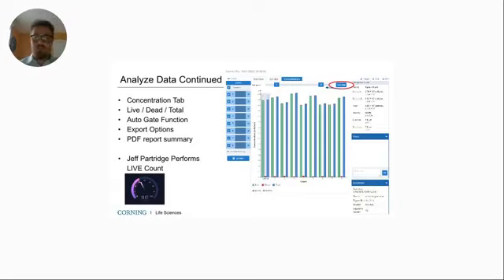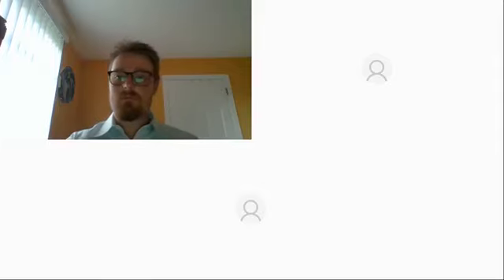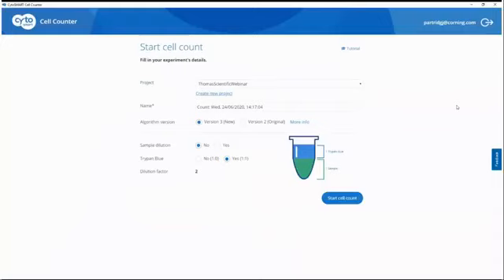All right, so without further ado, I'll pass this over to Jeff. All right, thanks, Alex. So I'll be counting some MDA MB231s today. Again, as Alex showed, this is the start cell count screen. So we'll just start here.